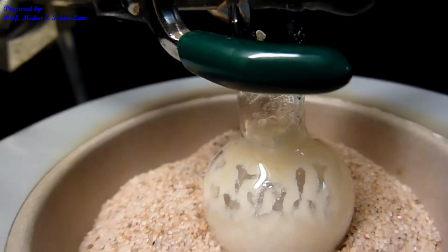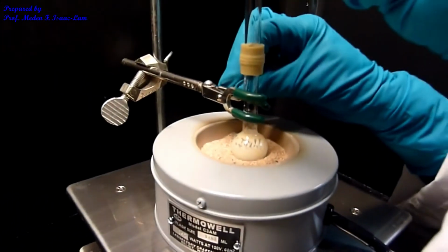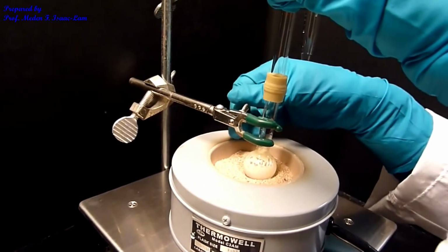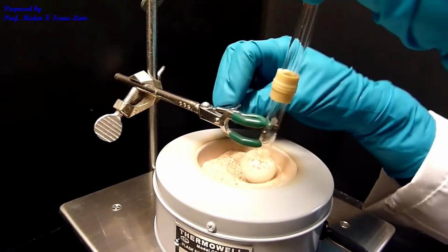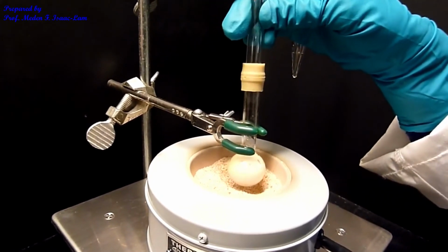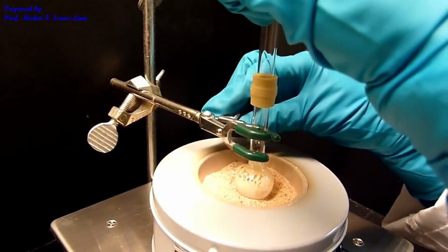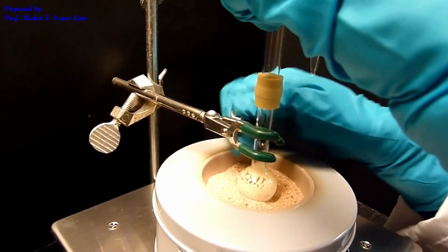So I constantly would take it out and then shake it to make sure that I'm mixing the reaction mixture. So occasionally I would do this. So we let it reflux for another half an hour, and then we are now going to do the next step.